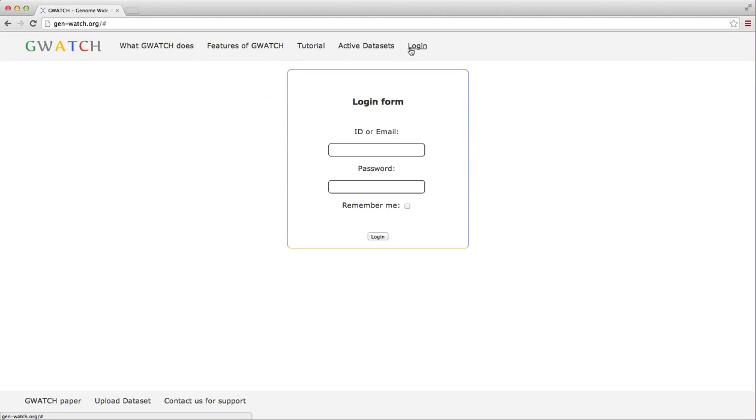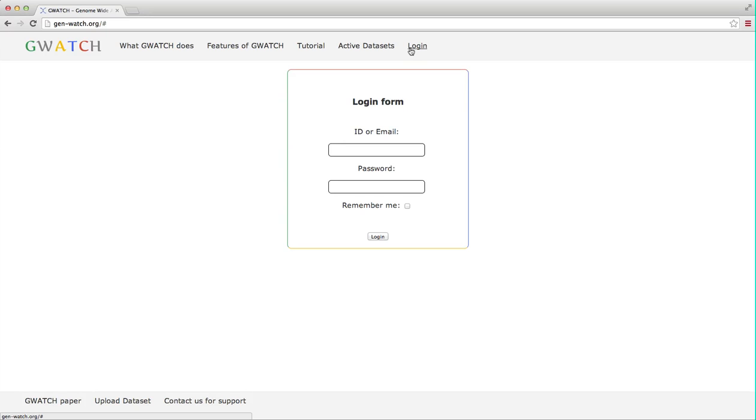The login button is for inspecting new datasets that are not yet open access and are password protected. This reminds me to say that GWATCH will accept data from any large GWAS or whole genome sequencing study. There are about 1000 GWAS published to date and we hope that many of these will try and embrace the utility of GWATCH for studying all sorts of human disease and other traits.